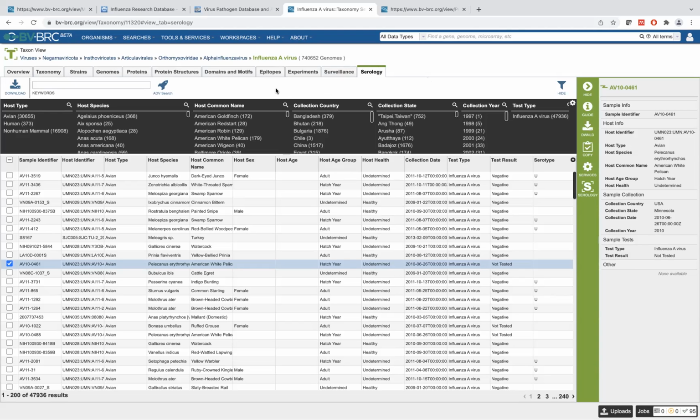On a day when there isn't a ton of other experiments in the queue, it can be as quick as 5 minutes. It really depends on the size of your data set. For de novo based assembly, it's a little bit slower, and again, it depends on the data set that you feed it.